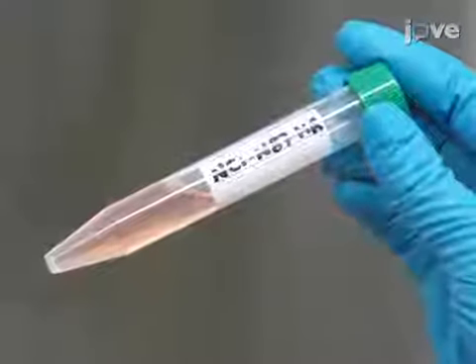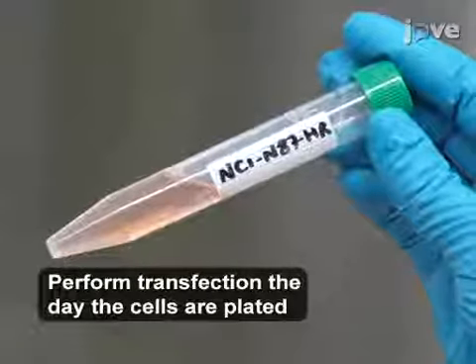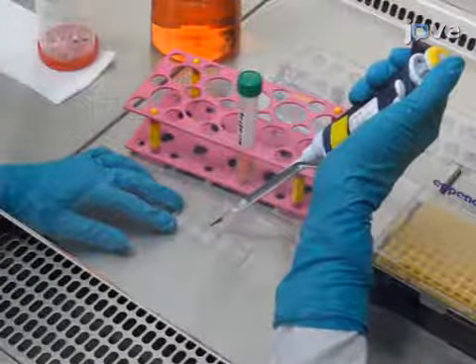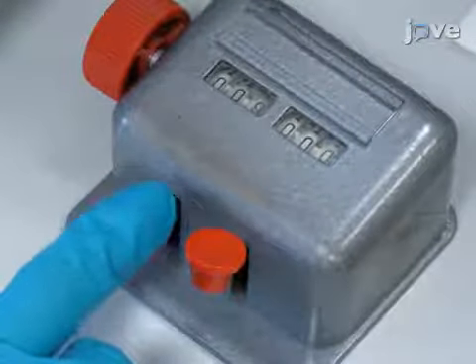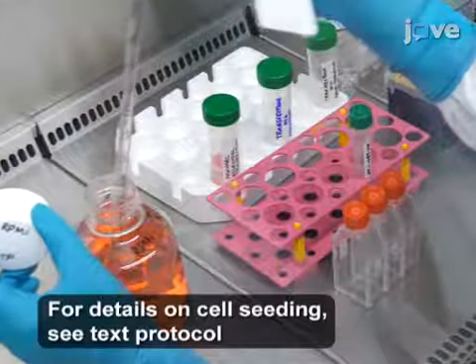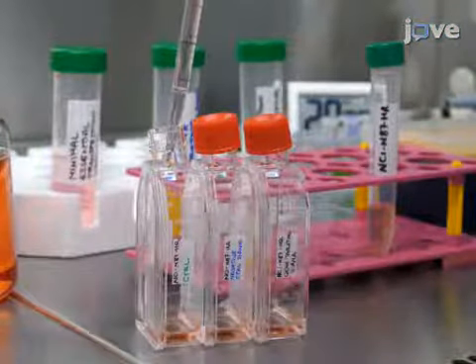To begin, prepare a single-cell suspension by trypsinization as outlined in the text protocol. Using a hemocytometer and trypan blue staining, count the cells. Then, seed 2.5 times 10 to the 5 cells onto a T25 flask for each condition.